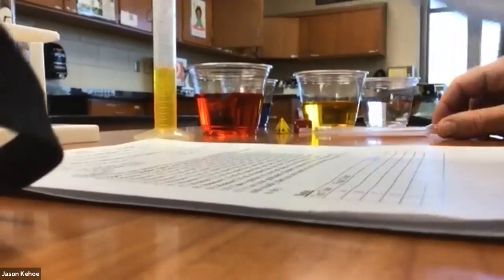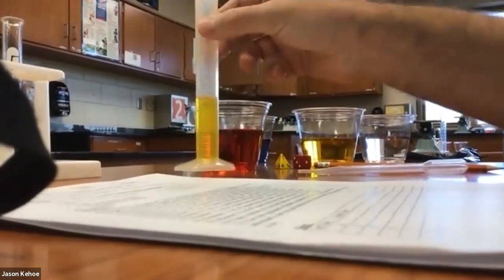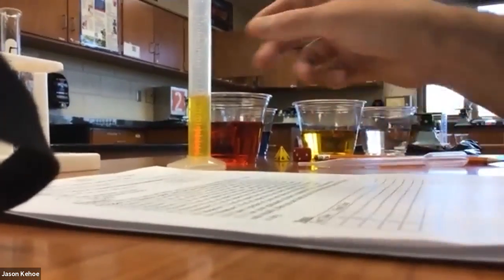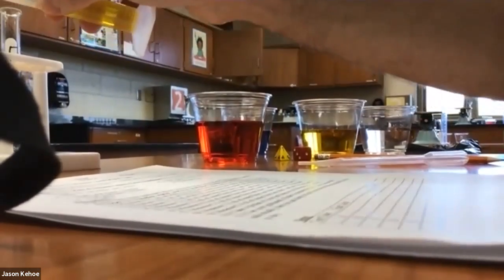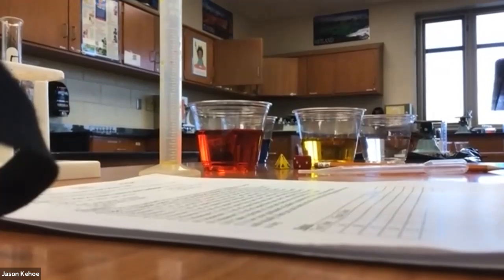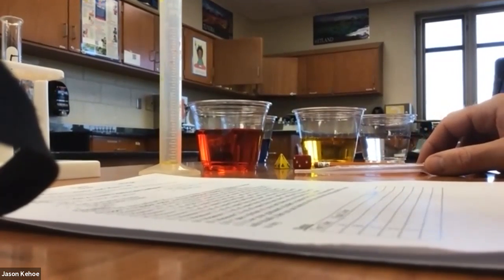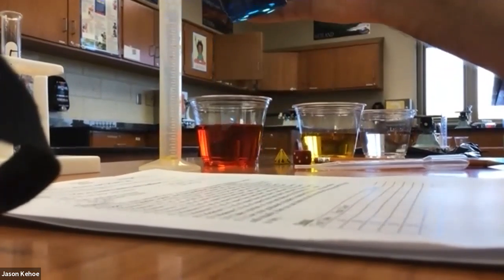And again, I am awesome, so I just happened to get that right on. My meniscus is right at that one small line above the 10. And again, each of these lines is worth half a milliliter. I'm going to put that in test tube C. I spilled a little bit, but I'm not going to stress about it. This is water and food coloring, not hydrochloric acid. Step 3, measure 11 milliliters of blue water from the beaker and put it into test tube E.